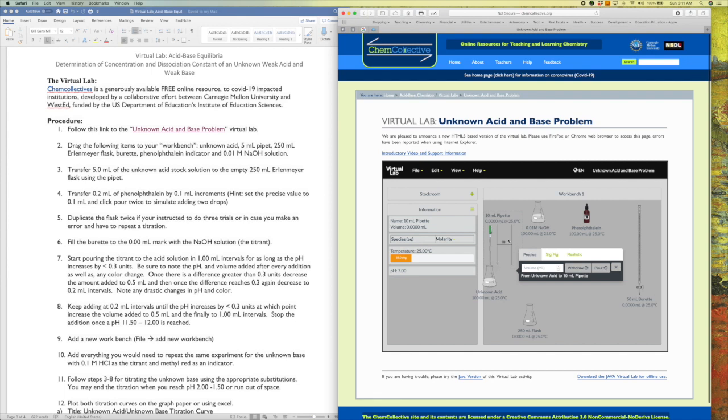And so you can see here what's done is there is a magnification being done of the graduated part of this pipette. So this is a graduated pipette. In reality, this pipette can only withdraw 10 ml. This program is not that finicky, but normally a graduated pipette would only be able to draw the amount of volume that the graduation is for. So this is for 10 ml.